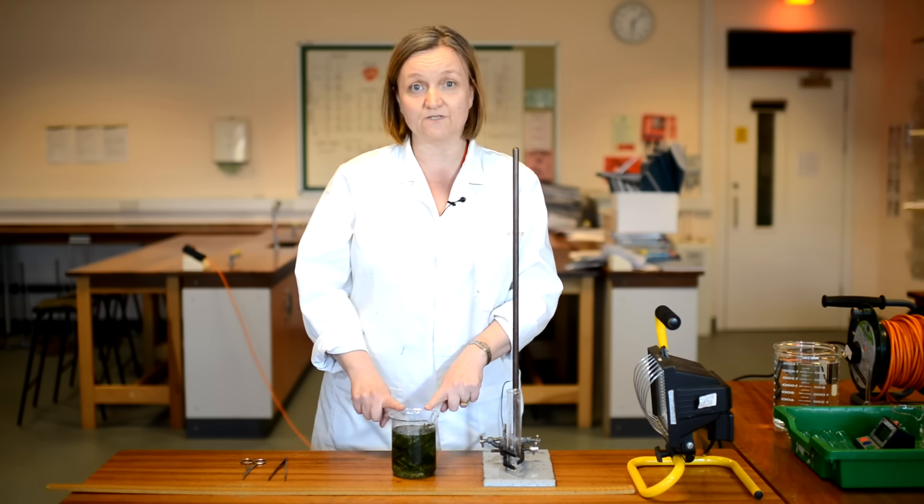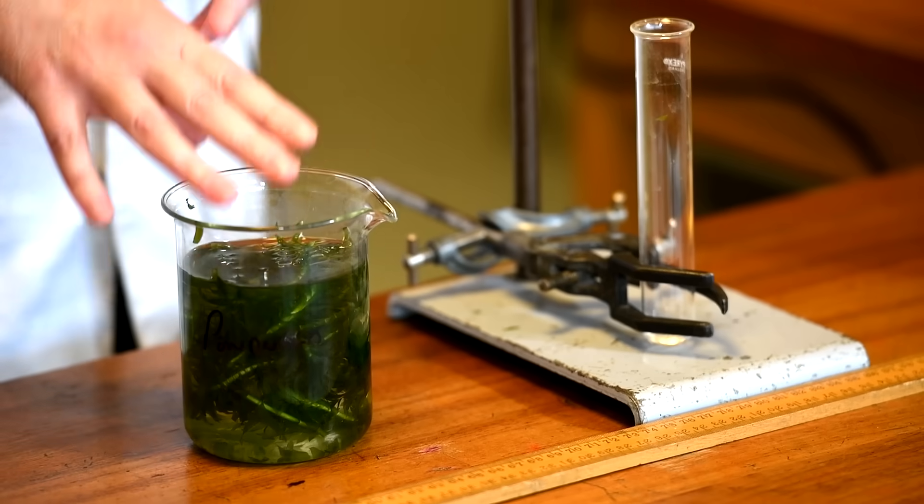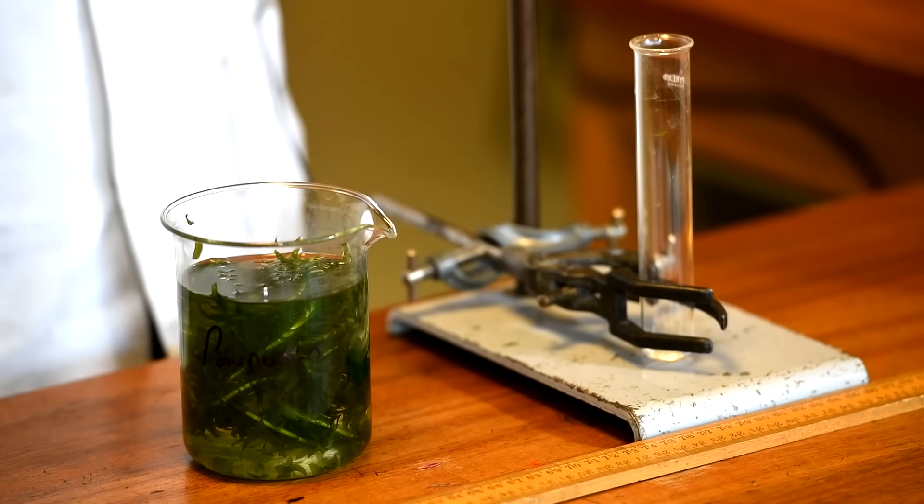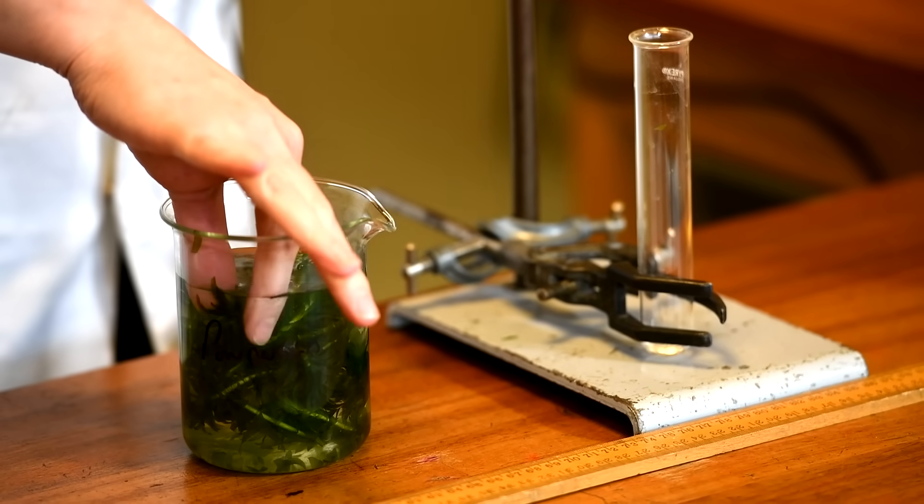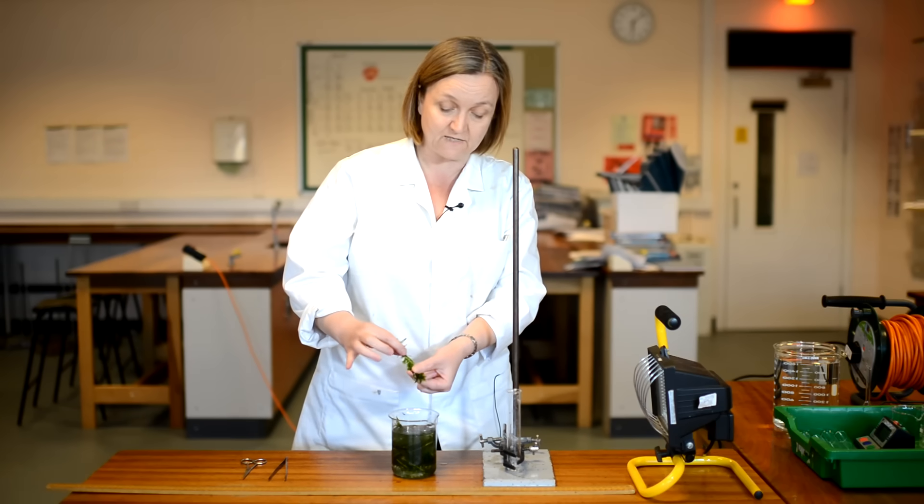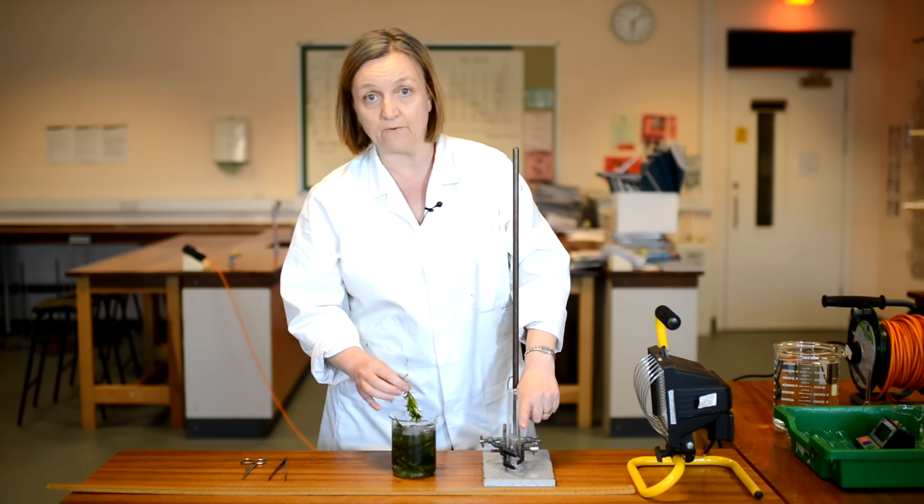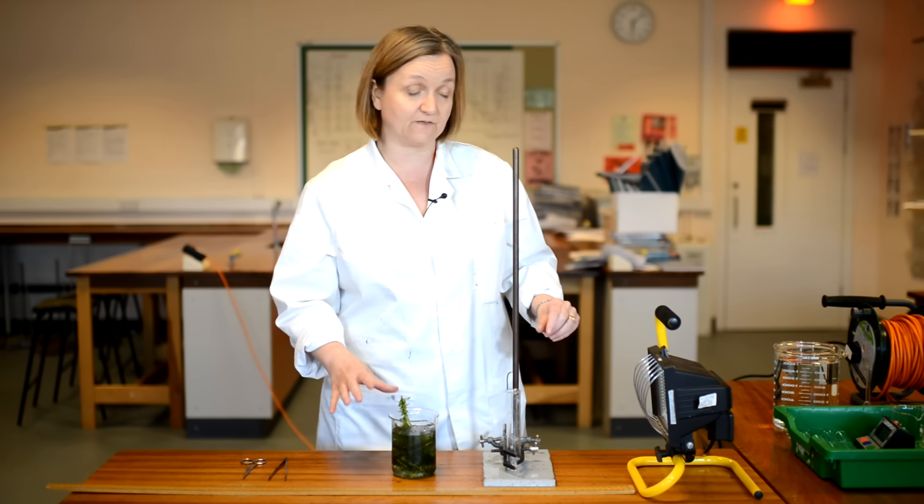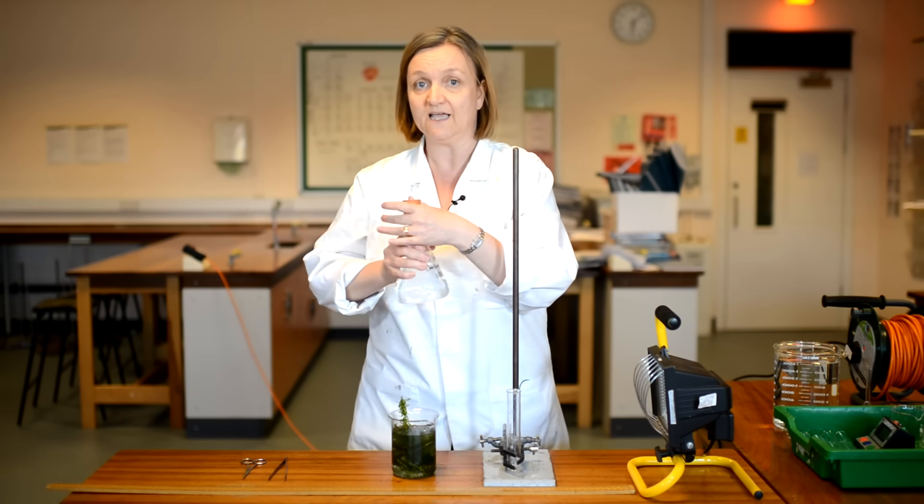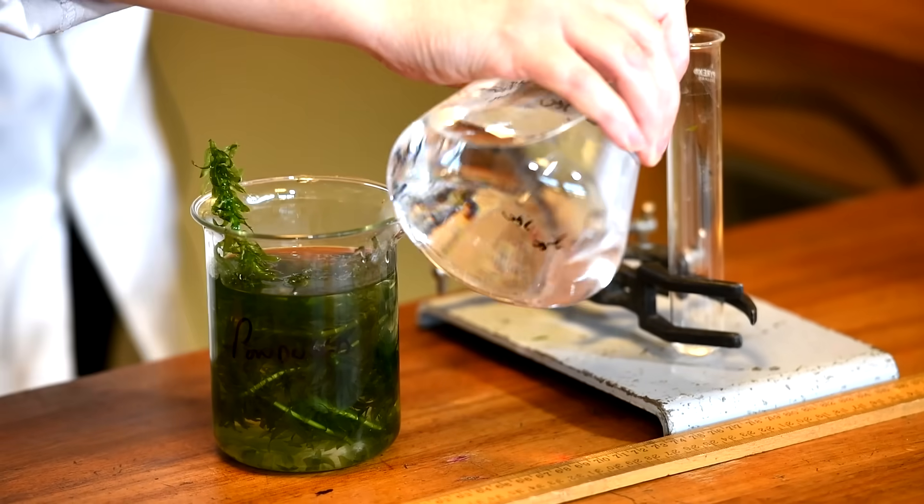So we're going to use an aquatic plant. This is just common pond weed that you can buy from a pet shop or a garden centre. And we've got this in some water at the moment, just keeping it nice and fresh. So we're going to take a piece about this long and we're going to pop it into a boiling tube. Now, before I do that, I'm going to put some sodium hydrogen carbonate solution in the boiling tube as this will encourage the pond weed to photosynthesize.